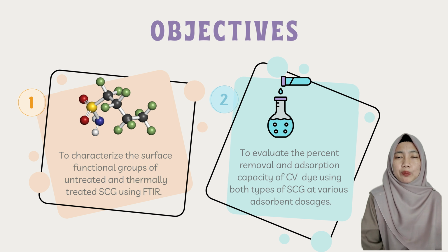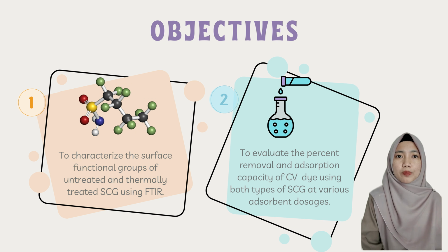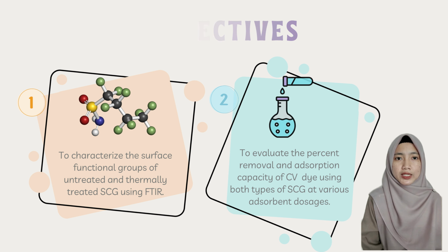Our study had two main goals. First, to use FTIR spectroscopy to identify the functional groups in untreated and thermally treated spent coffee grounds, and second, to compare their ability to remove crystal violet dye from water at different dosages.